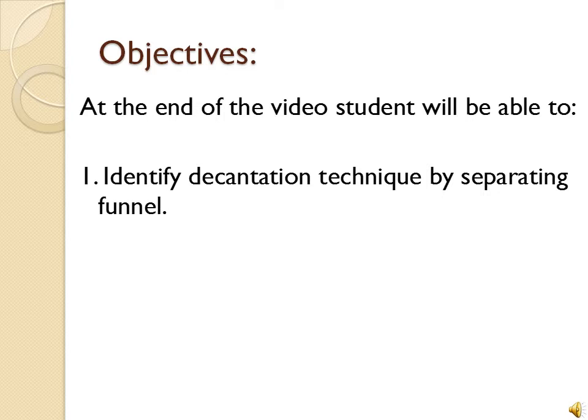Today we will continue our lesson about separation techniques in the chemistry subject, and by the end of this video you will be able to identify the decantation technique by separating funnel.